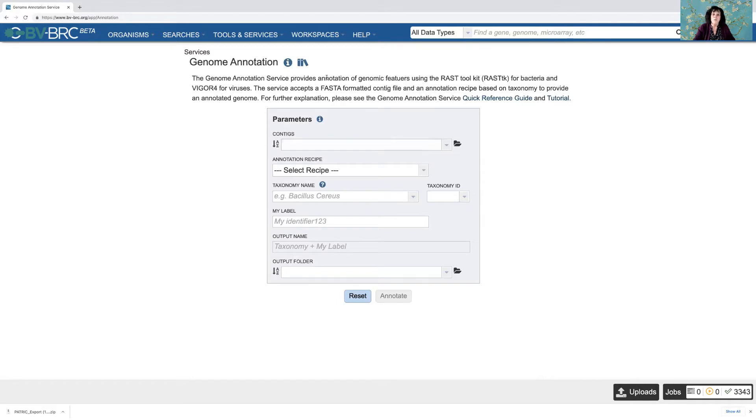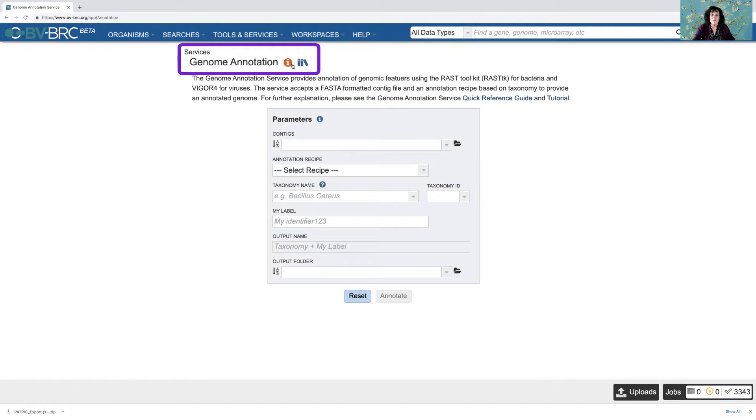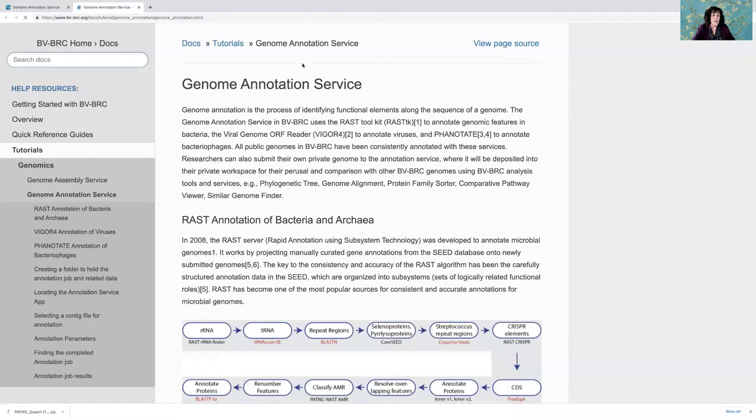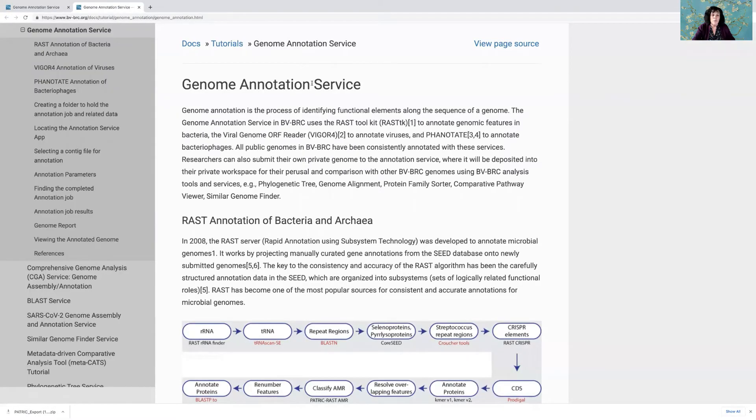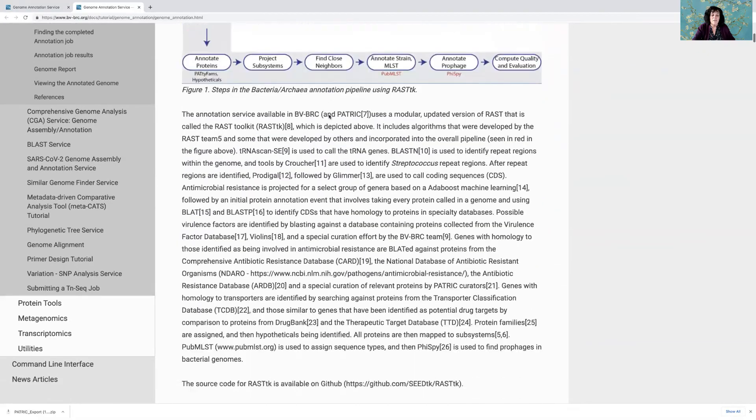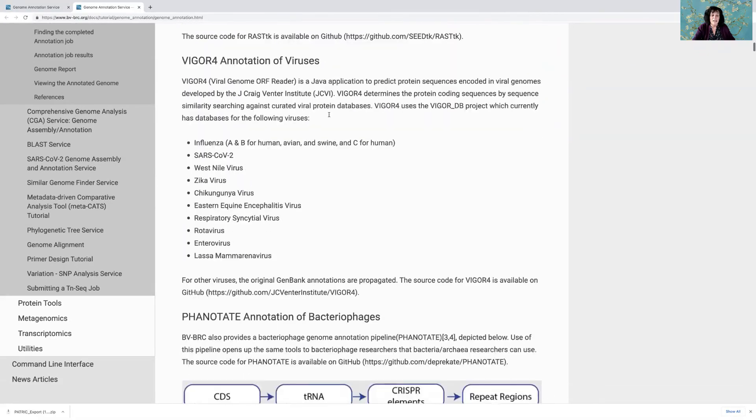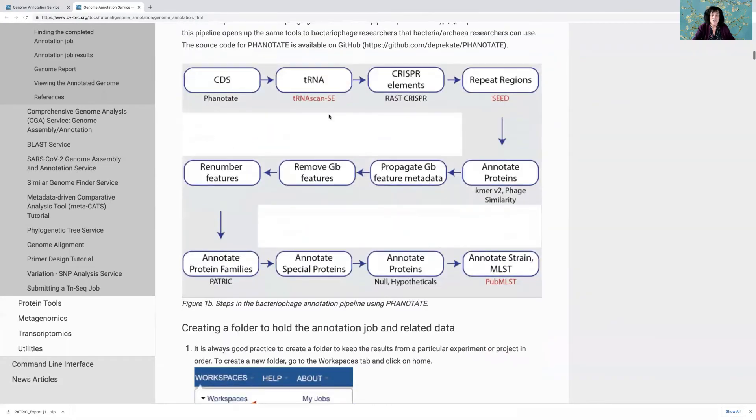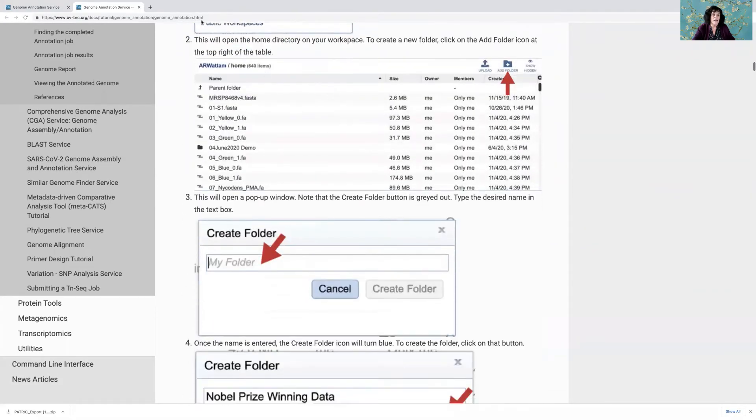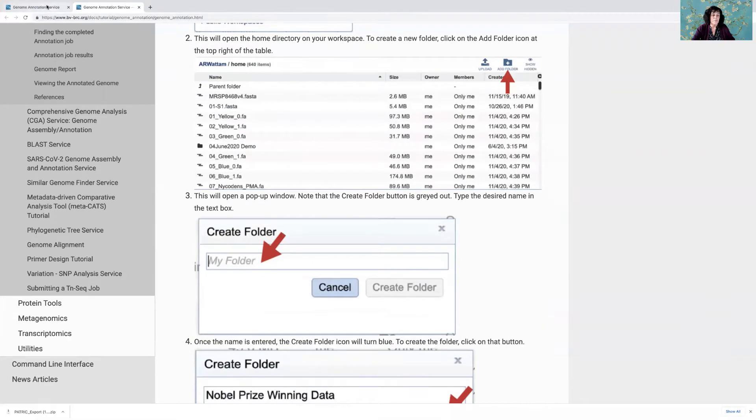If you have any questions about the service, at the top of each page there's a user guide and there's also a link to the tutorial that tells you what's happening behind the scene in annotation. So if you click on that, it'll open up a new tab that tells you exactly how the annotation service works and how to launch a job.